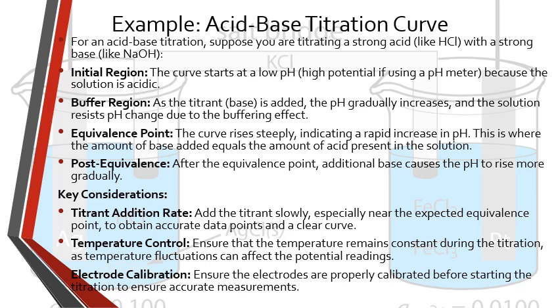The titration curve is a powerful tool in analytical chemistry, providing insight into the concentration of the analyte and the strength of the acid or base involved. The proper preparation and careful plotting of the titration curve allow for precise determination of the equivalence point and other critical parameters in the analysis.